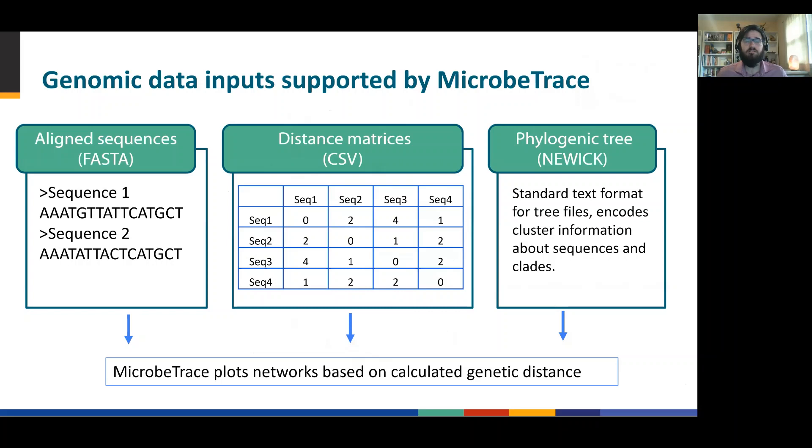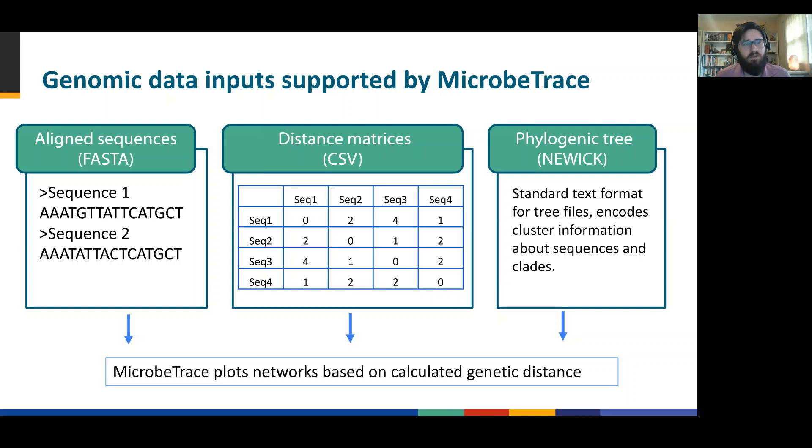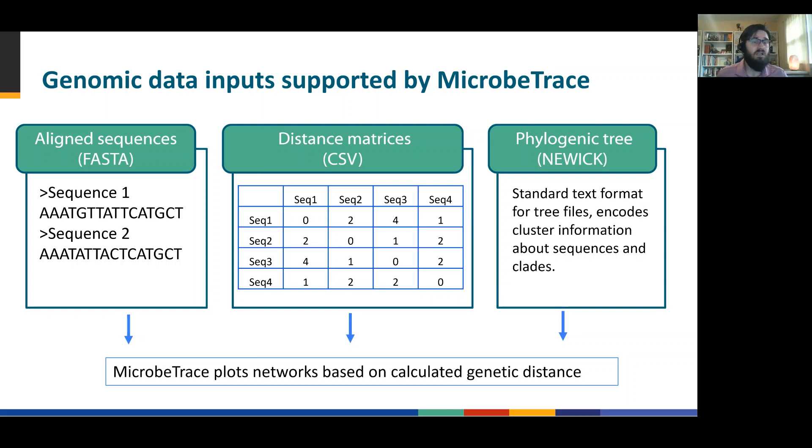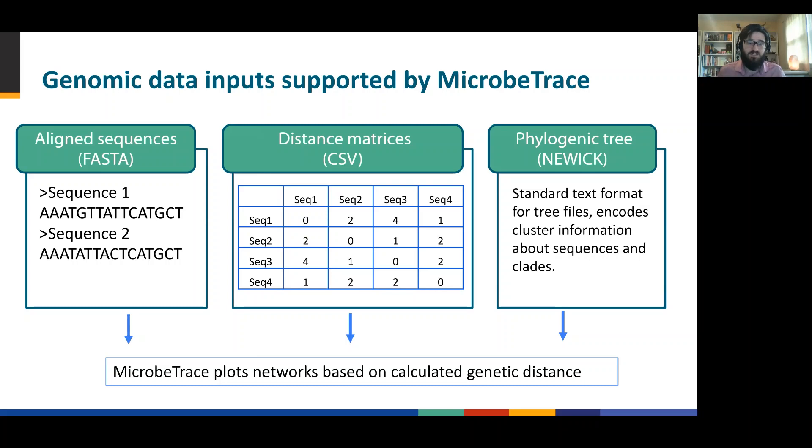Let's look at the different ways that we can import genomic data into microbe trace. Probably the most common and most frequent is an aligned sequence file in a FASTA format. On the left side, you'll see what that looks like. It's really just a simple text string where you have the sequence ID followed by the sequence. These often come in an unaligned format. And there is no difference between an aligned or an unaligned FASTA other than whether the sequences are aligned.